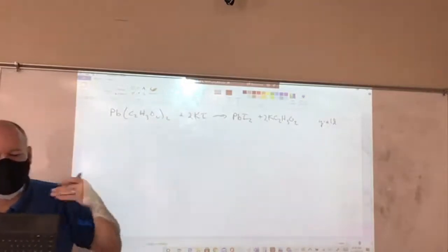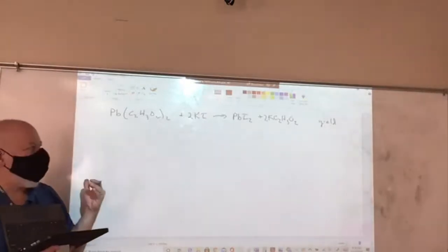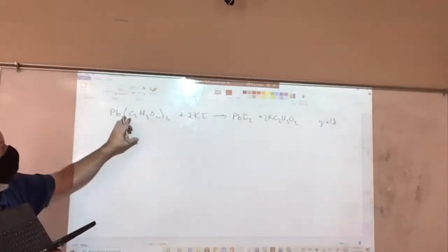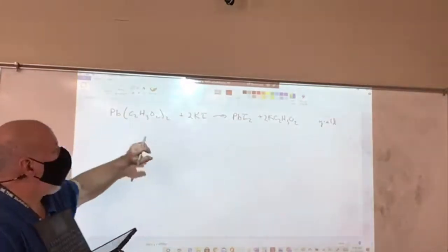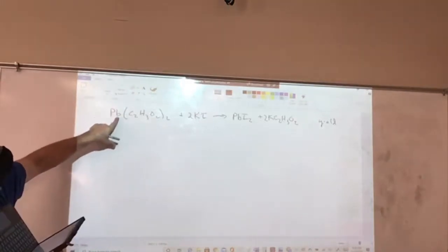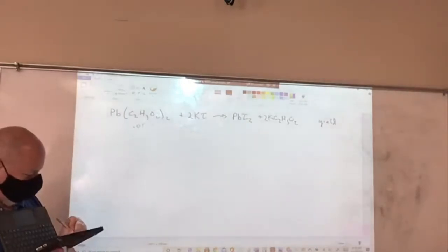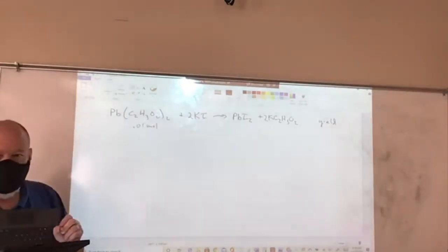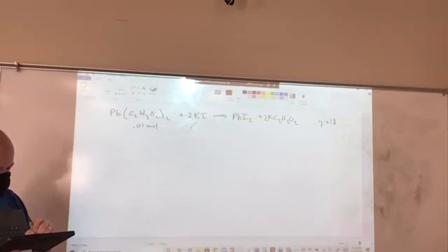I want to figure out what the yield of my process is. Okay? So if I want to figure out how many grams I'm expecting, I can look at my chemical equation again, and I can say, if I've got 0.01 moles of this, Marshall, yeah, what does that say to the right? Yield. Y-I-E-L-D, yield.